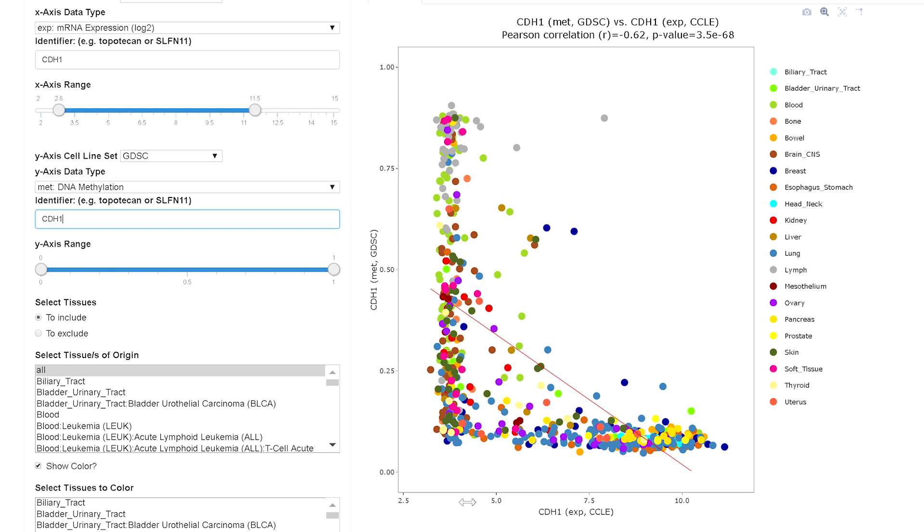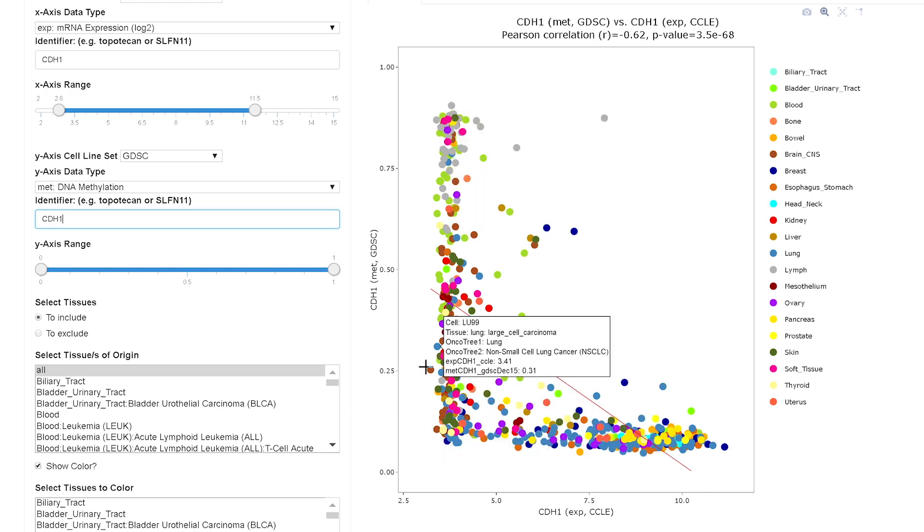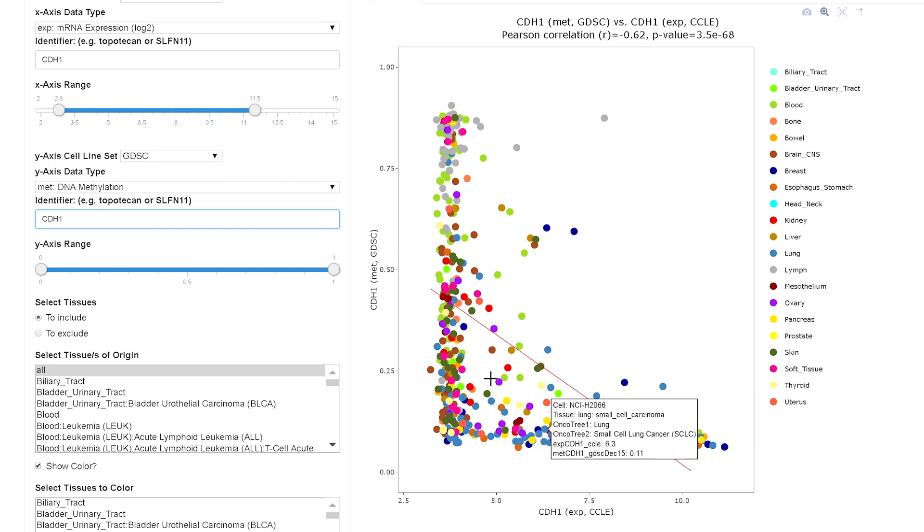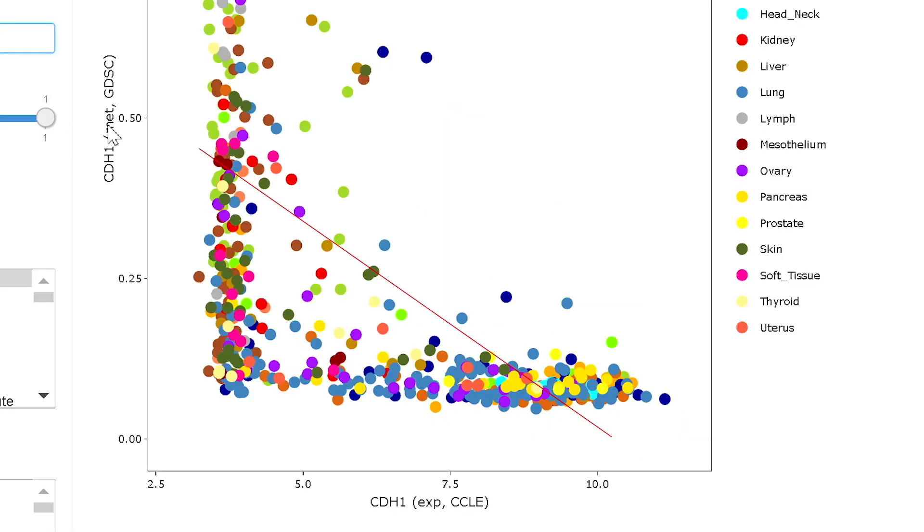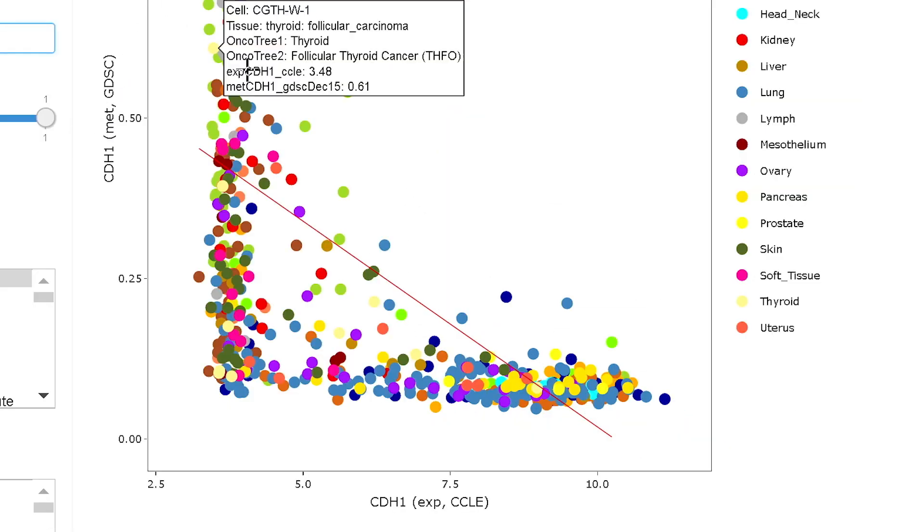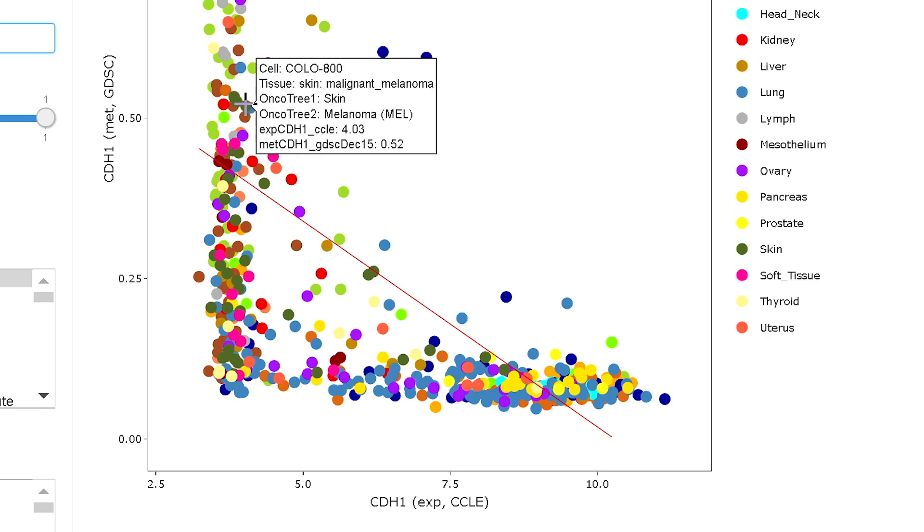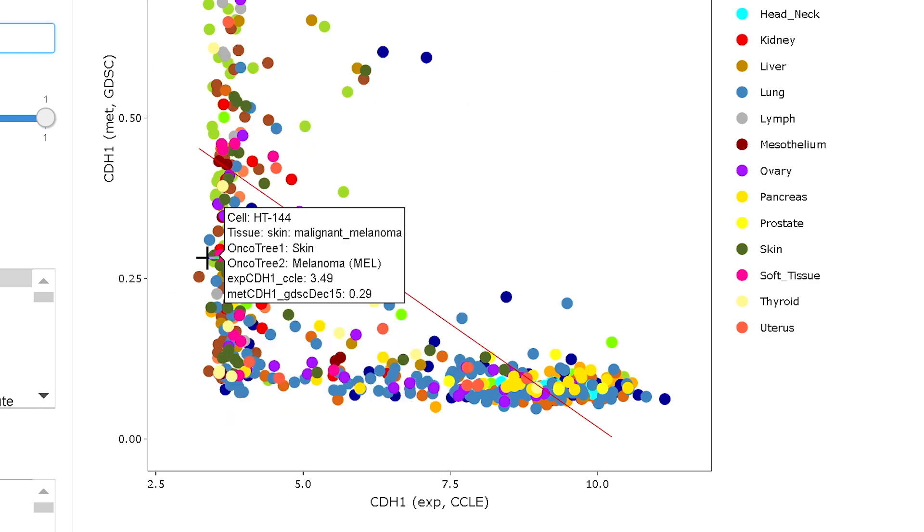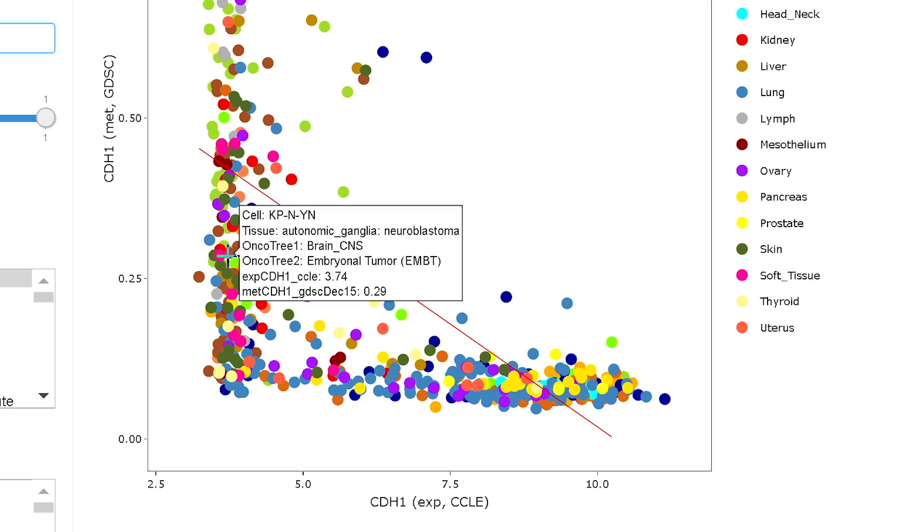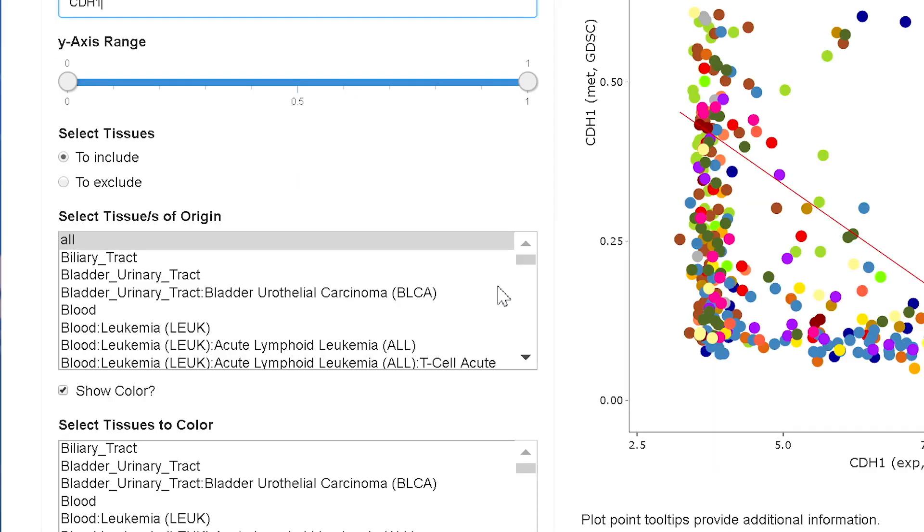And here's the resultant scatter plot. You can see here the expression of CDH1 on the x-axis and on the y-axis the methylation levels. And you get this nice L-shaped distribution which shows you that as methylation levels go up, expression goes to background. This is epigenetic regulation of a gene that you can demonstrate in this fashion.